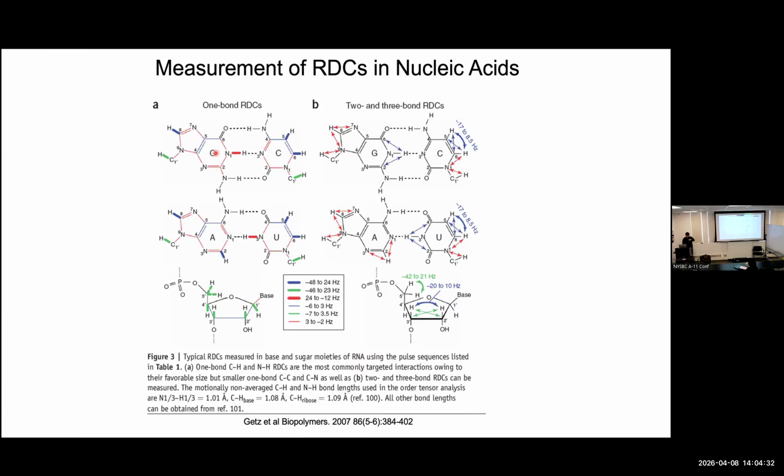What determines the peak position is, like we discussed, sensitivity. So we have the alignment and the sensitivity. And who enjoys better alignment, nitrogen or carbon? For the same reason that it has a smaller dipole coupling.